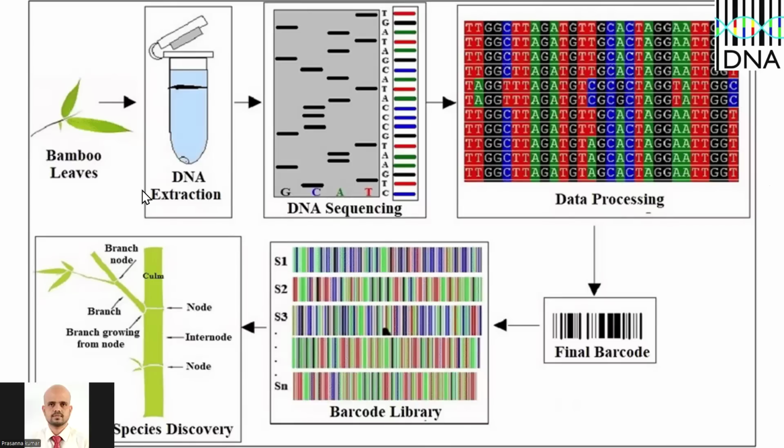And now, when someone who doesn't know how to identify this bamboo species A that you recently deposited in the database, he can simply go for sequencing the DNA barcode gene. Now the genes are compared with the database sequences and he will instantly know what species it is.